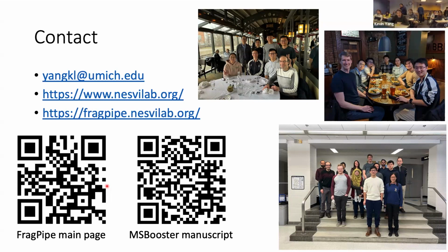Exactly, yeah. That data set is readily available, but there's also this idea that sometimes when you put so many different PTMs, for example, into a model, it starts to forget about the other PTM patterns. So I'm more of an advocate for having more specialized models when you have those available. But because there's so many things to train on, it's impossible to cover all of them. And for most use cases, where not all PTMs will actually change your spectra that much, I think the generalizable model that they have is actually quite good. And I'll be showing that in the manuscript as well. At least for HLA and non-tryptic, they perform very well because they have huge data sets for them.